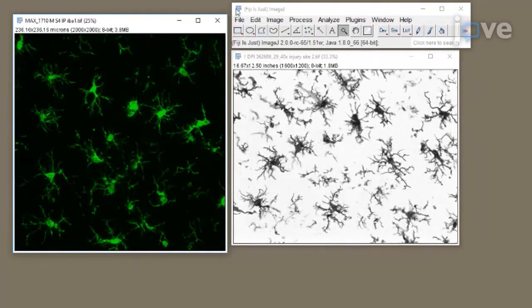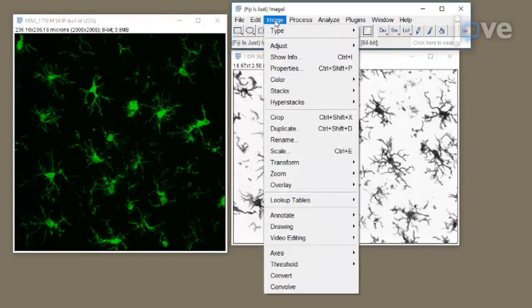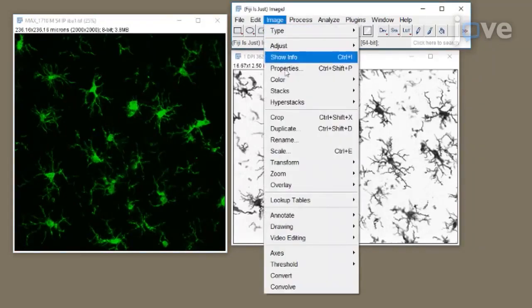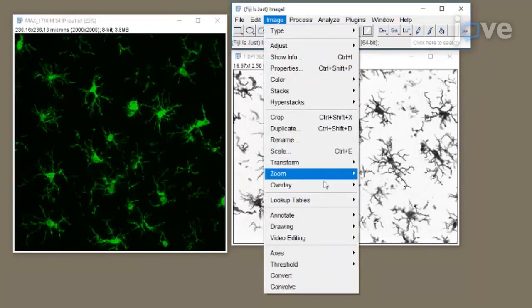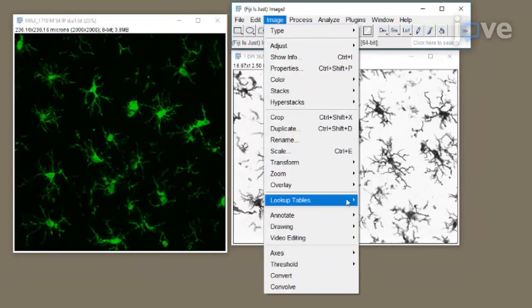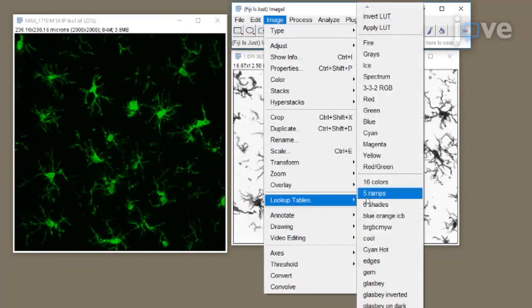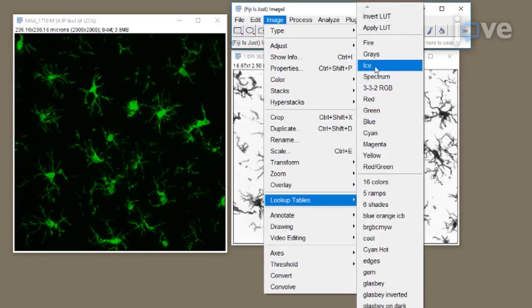If using a fluorescence photomicrograph, ensure the image is 8-bit and convert to grayscale to best visualize all positive staining. Use the toolbar and click Image, Lookup Tables, Grays.